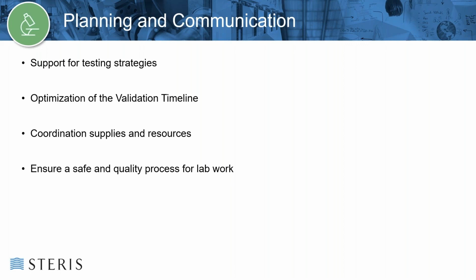When we do this and support these testing strategies, we optimize the validation timeline and also allow for coordination of supplies and resources to ensure that there are appropriate and adequate supplies to perform the testing when samples arrive, and that resources such as personnel and safety are established well before the samples arrive.